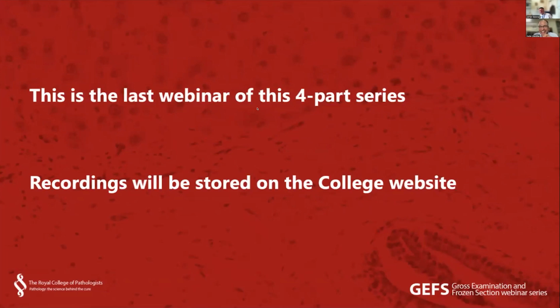Yeah, it can be very difficult. I agree. I would try and do all the things that I've said. I think separating the adipose tissue from the rest of the specimen can be particularly helpful in that setting, for sure. You might have to return to the specimen when the tissue is better fixed. Some people say that that's a setting where using fat clearing can be potentially useful, although again, even if it is potentially useful, most labs won't be set up for that.